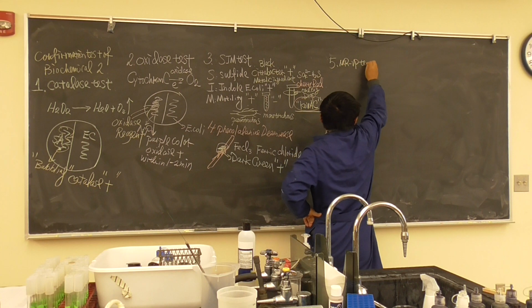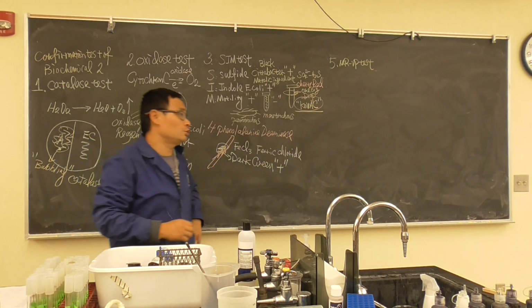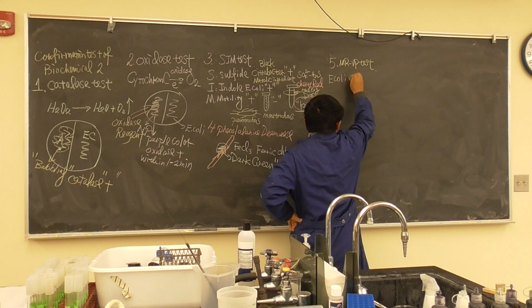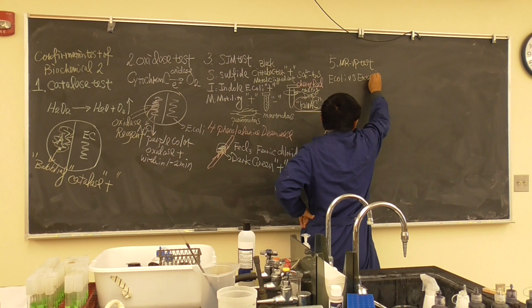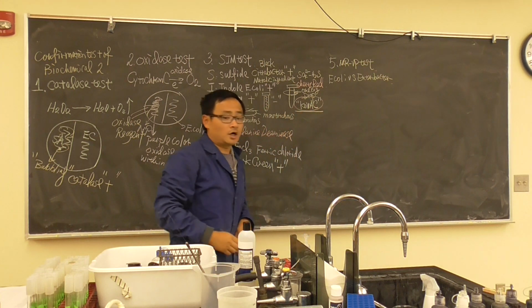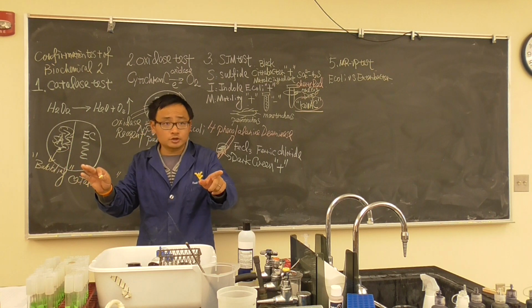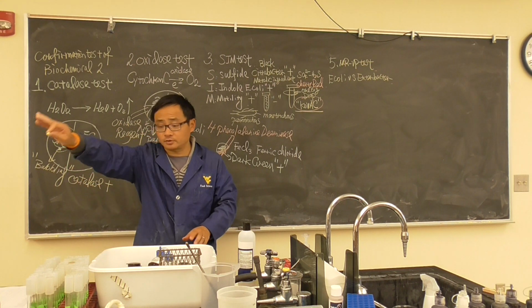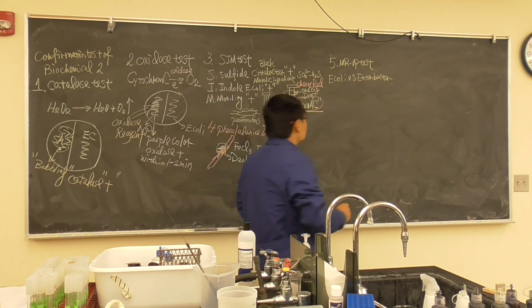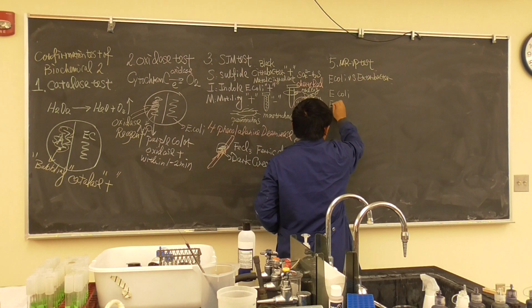Now, the last one. MRVP test. Okay, MRVP has E. coli. There is a 2 way to do, which is E. coli versus Enterobacter. How you do it? As a pair, is that right? And you also working with a person who is across the aisle. So which means 4 of you will be a group. Okay, you have E. coli. You have Enterobacter.